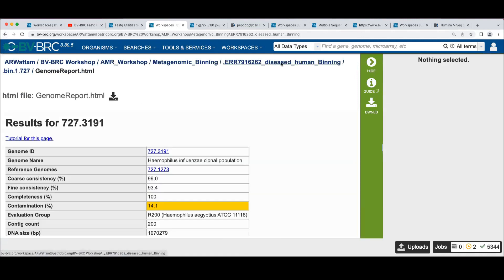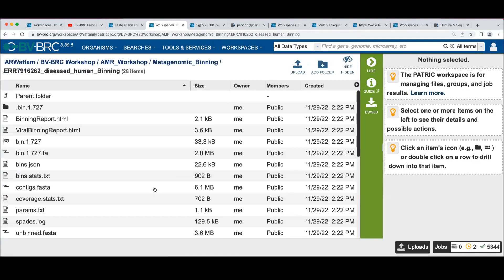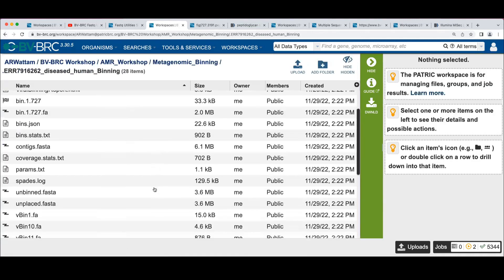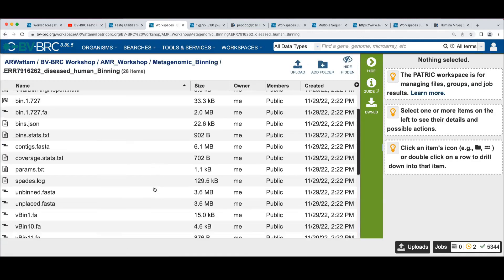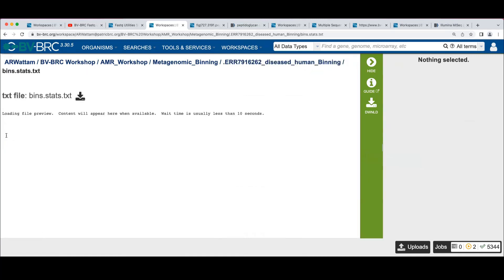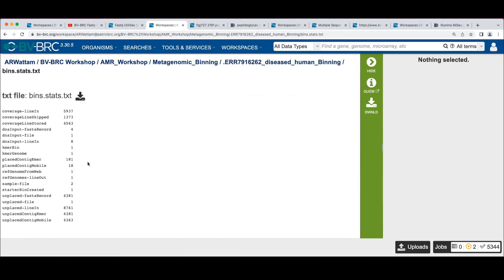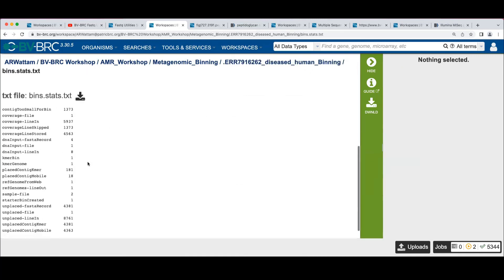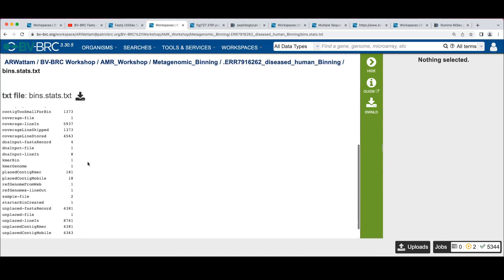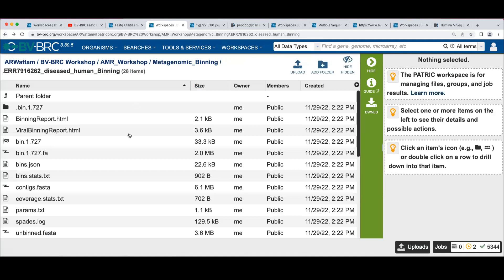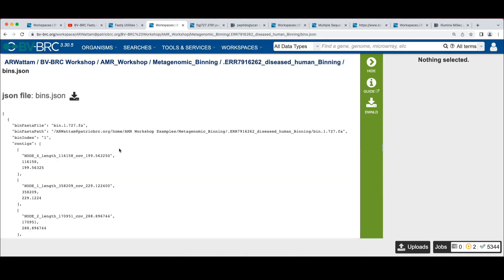Let's go back and see what else we have in here. There's a bunch of statistics files in here that are sort of artifacts of the binning run. They probably don't mean anything, but they give you some idea of what the binning was up to. And if you want to really geek out and go deep into this, we'll get you in touch with Bruce, who's the guy who did this, and he will tell you all about it.